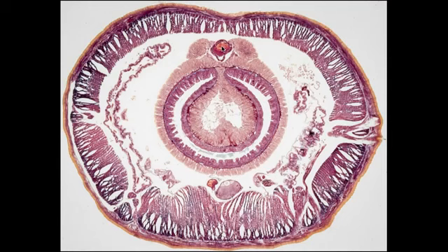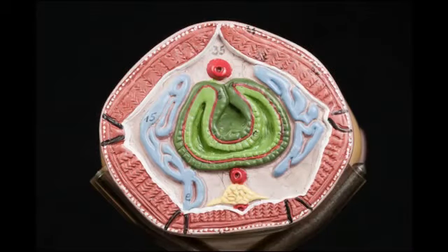At the top is the dorsal blood vessel. This is the intestine with its lumen. And of course this is the typhlosole. Beneath the intestine we have the ventral blood vessel, and this structure is the ventral nerve cord. Identifying the major parts in both the model and a microscope slide will make it much easier for you to identify them during the laboratory practical.